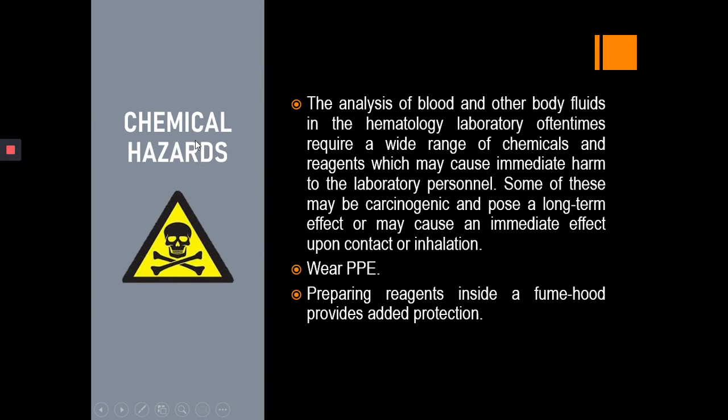Next, we have the chemical hazard. Most of the reagents being used inside the hematology laboratory may cause immediate harm to the lab personnel when not handled carefully. Some of these reagents are carcinogenic and pose a long-term effect, or may cause an immediate effect upon contact or inhalation.